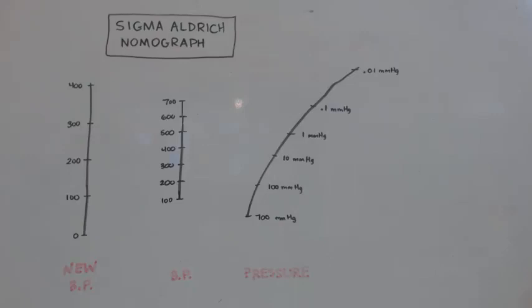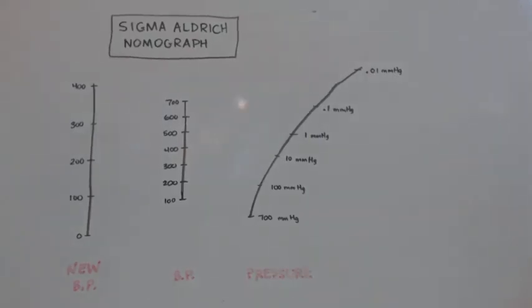First one there says new boiling point. That would be your boiling point, because what a nomograph is, it tells you the boiling points of liquids at different pressures. Normally a vacuum, at a different lower pressure. Now, you can plot them on there. Let me see.